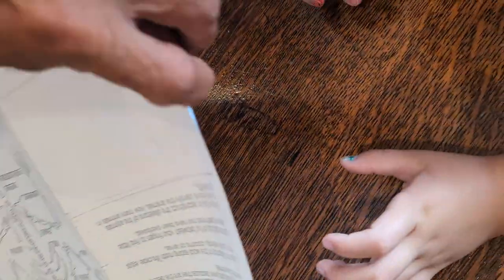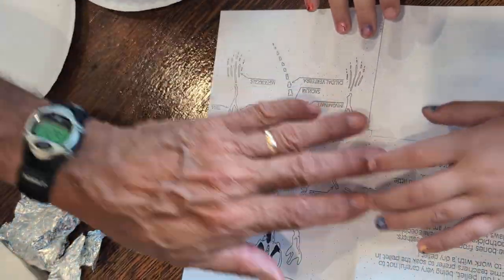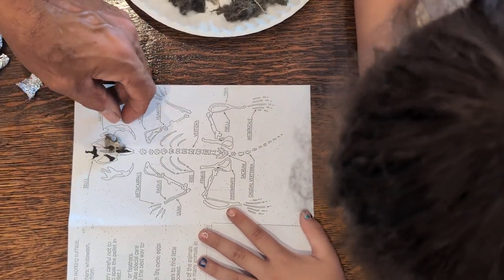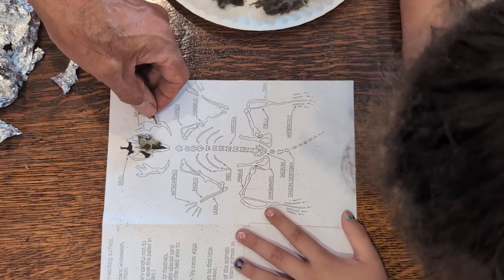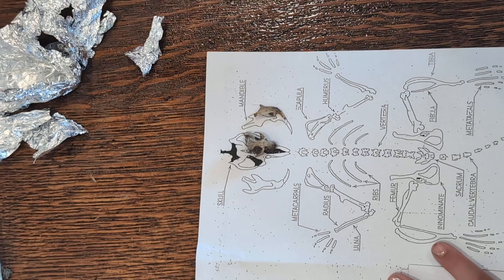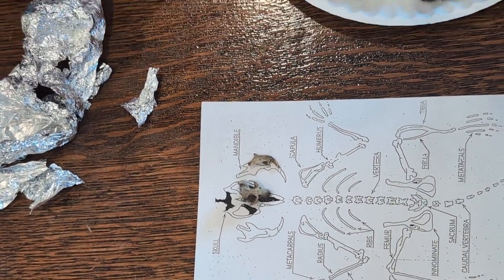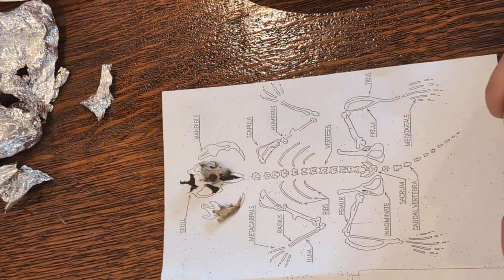Let me twist the paper just a little bit so it's oriented towards you. So here's where the skull would be, and here's a right side jaw. This is a left side jaw, and that's another left side jaw. Here's a right side jaw. See how there's bone on the outside and the molars are on the inside of the mouth — that's how you tell it's the right side jaw.